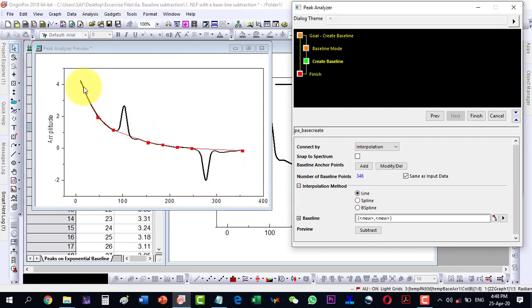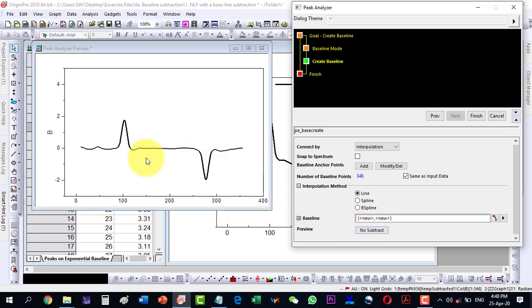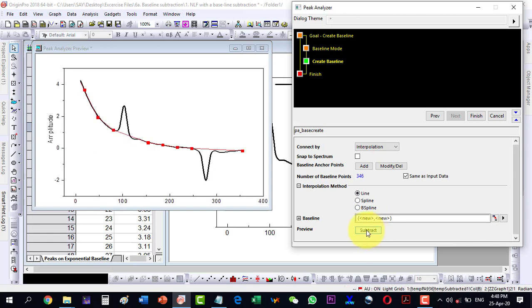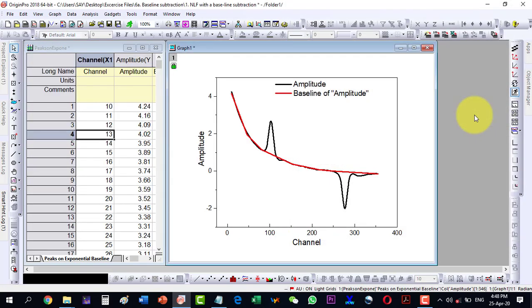Now the baseline is visible. If I want to see how the plot will look, I click Subtract and it shows a preview of the plot with the baseline subtracted. This is just a preview, so I click Finish and it has created the baseline.